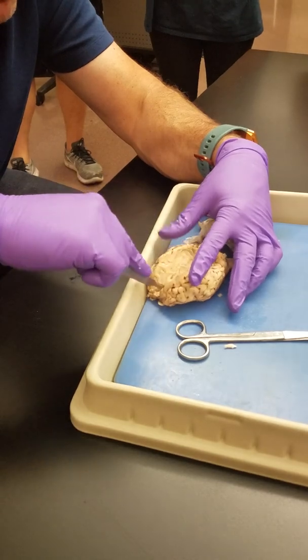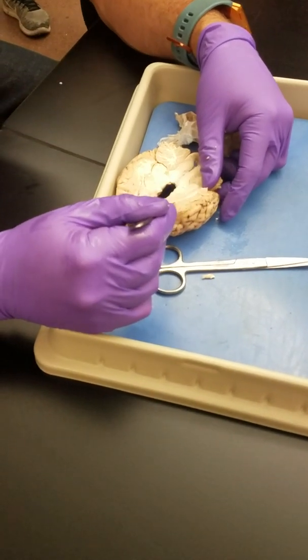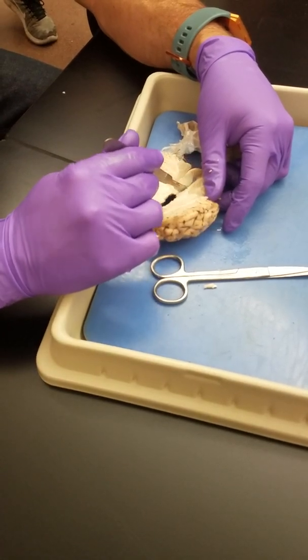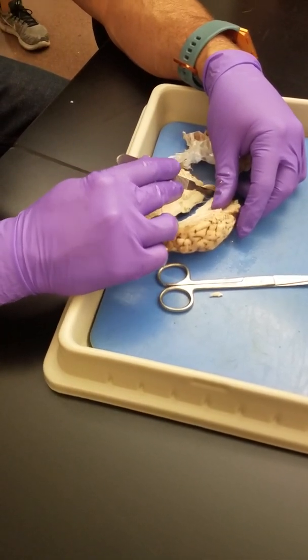You can see the brain is hemispherical. Here you see this large white thing right here. This is called the corpus callosum, which means white body. The corpus callosum is a large chunk of myelinated tissue. This connects the two hemispheres of the brain. This allows the right hemisphere to talk to the left hemisphere and vice versa.